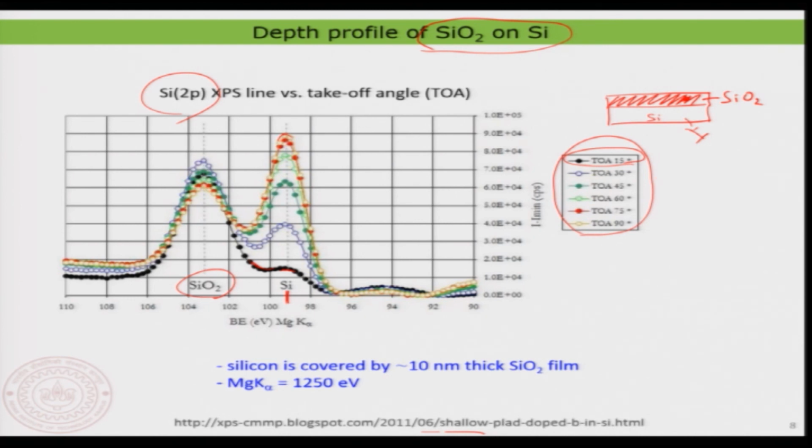So this is quite beautiful. If you do angle resolved XPS, you are extremely sensitive to the surface, and therefore you can detect what is going on at the surface directly, and that is why XPS is quite a celebrated technique in surface science.